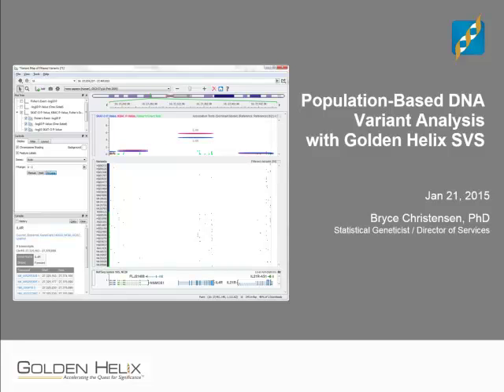Okay, Cheryl, thank you for the introduction, and I'd like to welcome our audience here today for today's presentation. Today we're going to, as Cheryl mentioned, talk about population-based analysis of data coming from next-gen sequencing platforms. We'll discuss primarily rare variant analysis, but also talk a little bit about some of the things you need to know when it comes to analyzing the common variation that is identified through sequencing experiments as well.